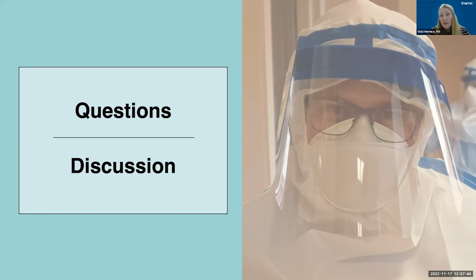So sure, it can be done. Just again, keep in mind your risks. If you can separate yourself as much from the patient as possible, but you also want to make sure you consider the PPE that you're using since you will be in the patient room, and cleaning up, making sure that your laboratory supplies are sequestered as well.